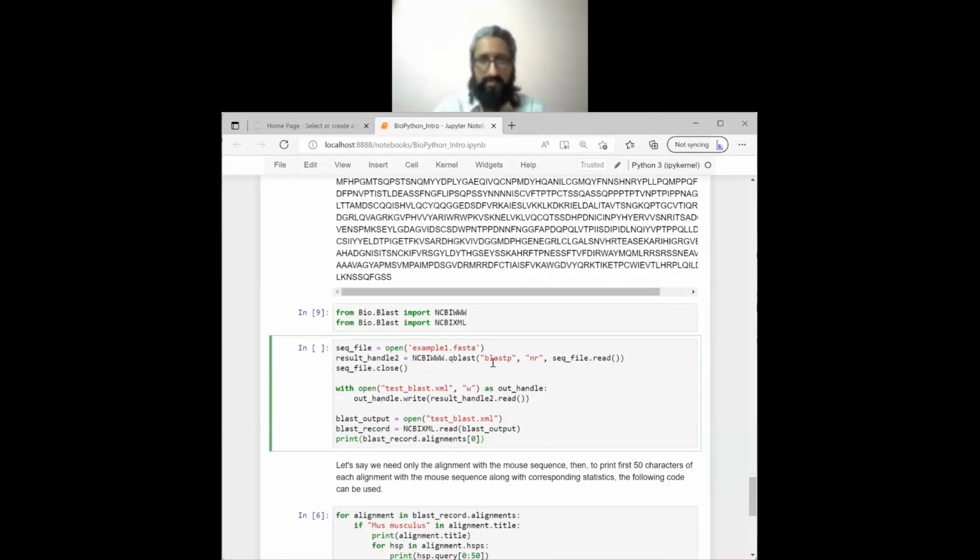And if you run this part, you will see the top hit. Instead of doing for loops, we are just saying square bracket 0, because the 0th element of the list is the top hit, since results are sorted by score. So if you run this, you will see the output, and in the output you will see the organism name, and that would be C. elegans.